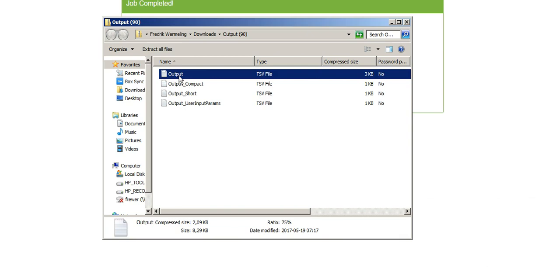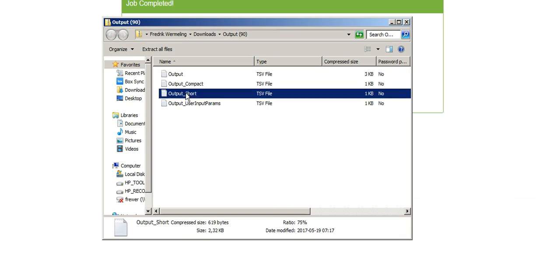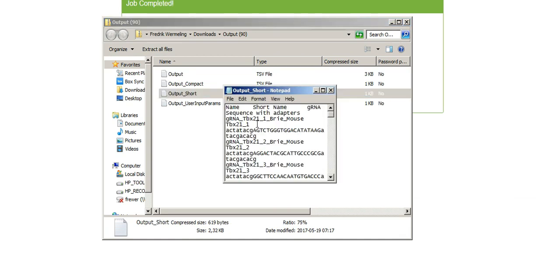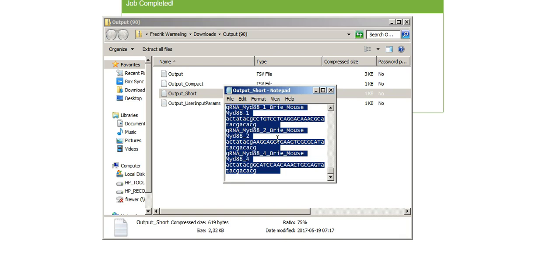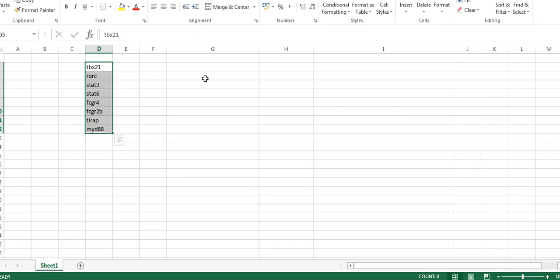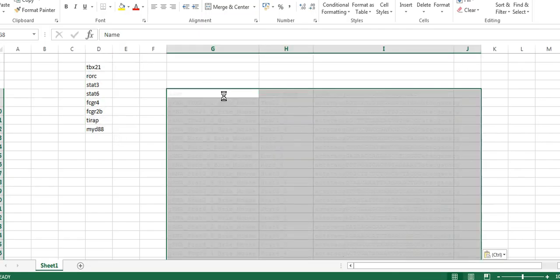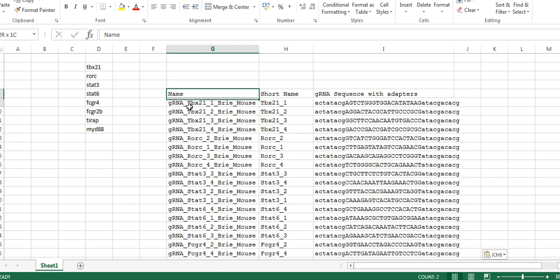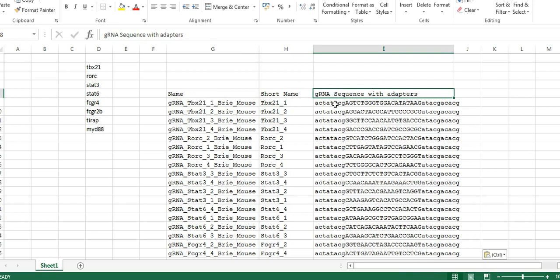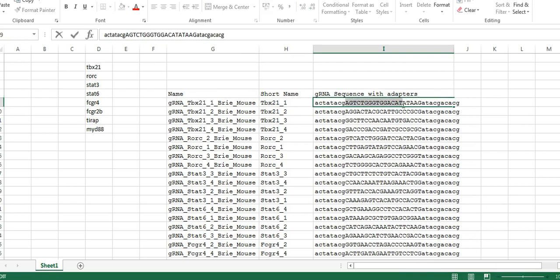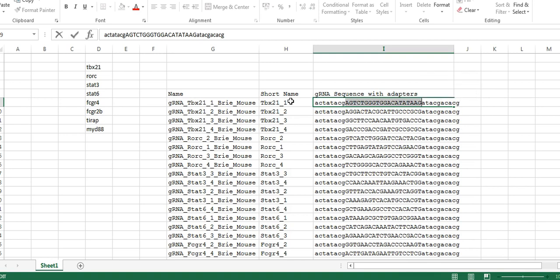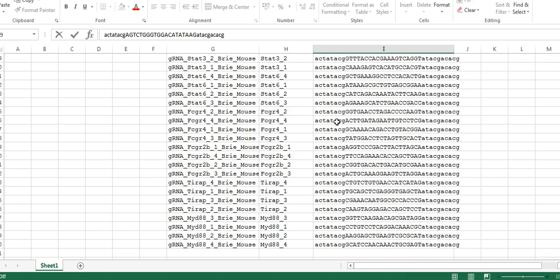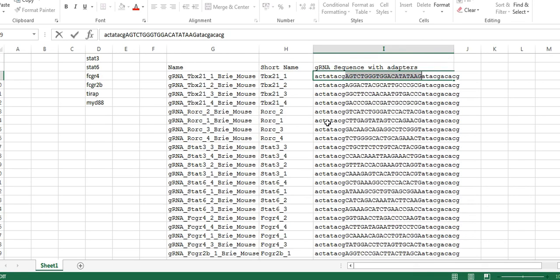One output, which is a full file containing a lot of information, perhaps a little bit too much information, about the different guide RNAs that are suggested. And then there's an output short here. If you press that one, text files could be hard to read. So I suggest that you copy them, you go to Excel, and you paste them. And what you find in this file is then a long name, a suggested short name for the guide RNA, and then the guide RNA with, so this is the guide RNA, and these are the overhangs. So you see, you get a list here pretty rapidly.